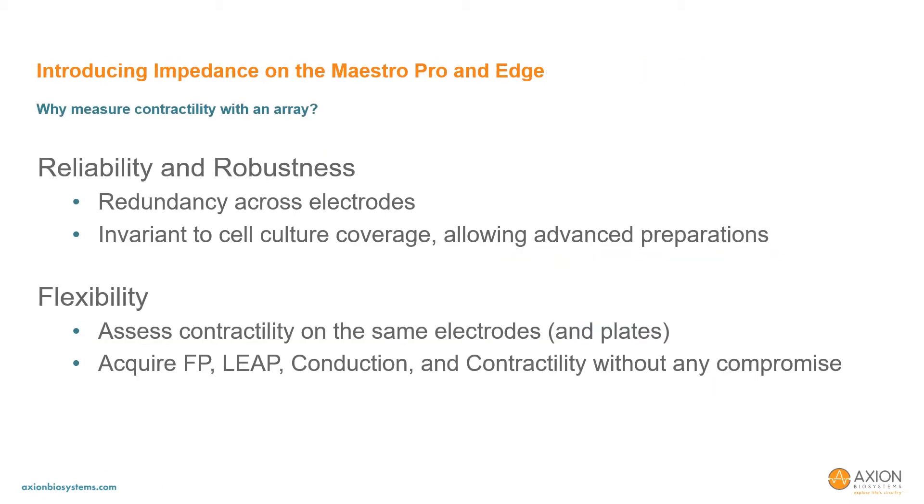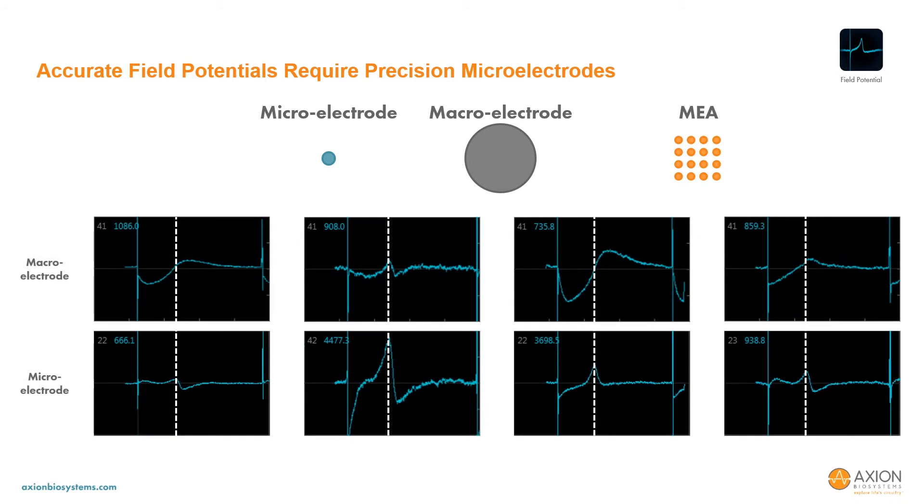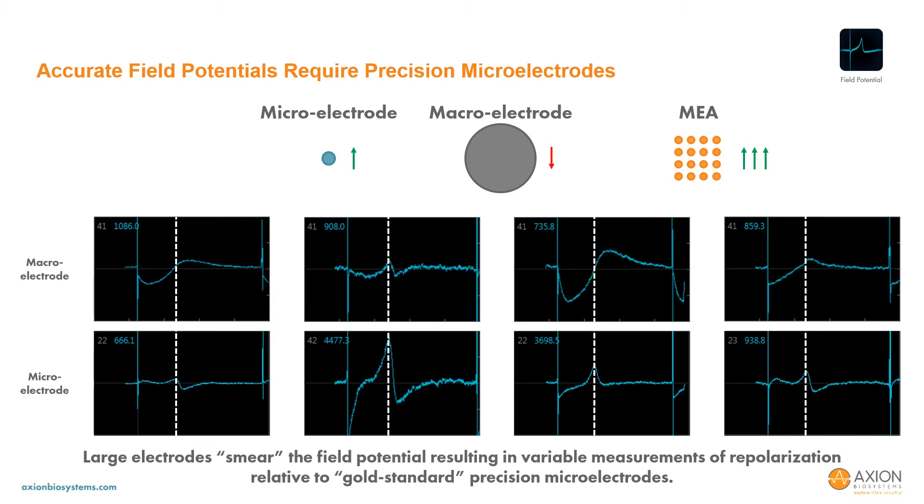As an extension of this concept, flexibility highlights the second design consideration and advantage in developing array-based contractility. By using the array for contractility, the user doesn't have to compromise between contractility, field potential, LEAP, or conduction. All aspects of the Maestro cardiomyocyte assay can be performed at high quality on the same plates. For instance, a large electrode has poor performance in field potential assays. Here we show field potential recordings from a microelectrode and stimulation paddle recorded simultaneously from different wells in an Axion MEA plate. Clearly, the larger stim paddle provides an inaccurate measure of the field potential as the repolarization feature doesn't line up with the microelectrode in the same well. Furthermore, the inaccuracy is inconsistent across wells, making the field potential measurements from a large electrode very deceptive. Due to the smearing of the field potential by large electrodes, the array-based assay is the only way to ensure accurate field potential and contractility signals from the same cardiomyocytes.